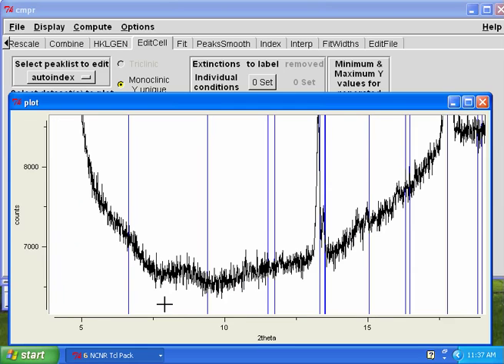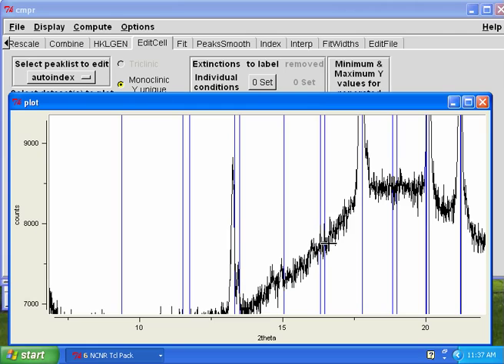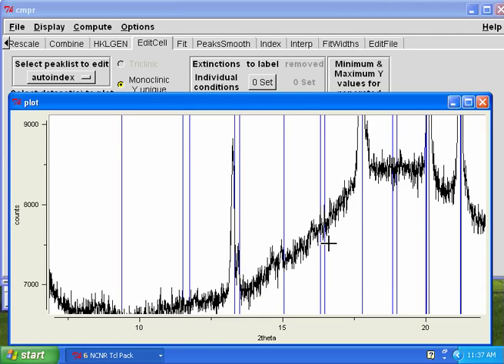Okay, well, now we have two lines. They're not quite in the right places, but at least we have several lines. We might be interested in seeing what the indices are on these lines. If we press H in the area, we'll see that there are 3 diffraction lines here. There's the 0 2 0, the 1 bar 0 1, and the 0 1 1 lines.